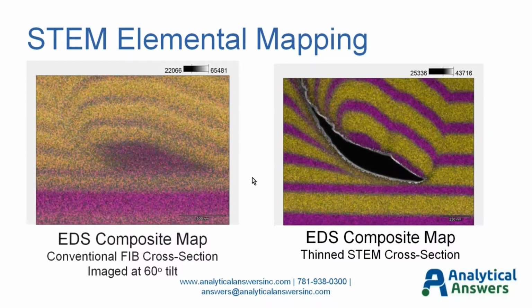If we switch now to this scanning methodology where we use a very thin sliver to confine the beam, the improvement is dramatic. So not the exact same defect, but the same materials. You can see we preserve the spatial resolution that our SEM offers us. The interfaces are very sharp. We can see layers here on the order of 250 nanometers to 50 nanometers in thickness.